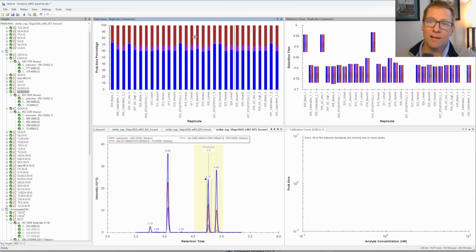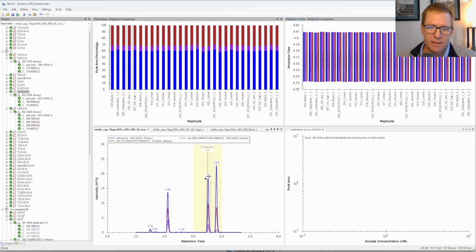In this case, I will highlight, however, that when we talk about using MSMS to identify small molecules, I will just let you be the judge of whether or not it's easier to see the outlier in this ion ratio molecule view or the outlier in the retention time view. Clearly, my opinion is that it's easier to see these outliers, and so it's good to have both. So we're going to click here, and then we're going to go back to this peak to correct that integration across all of the peaks. Okay, so that's 3, the ion ratio view.